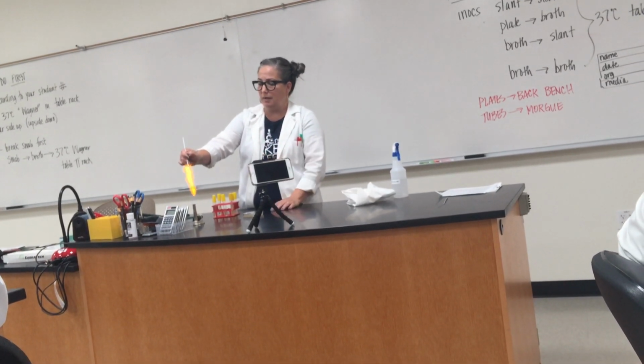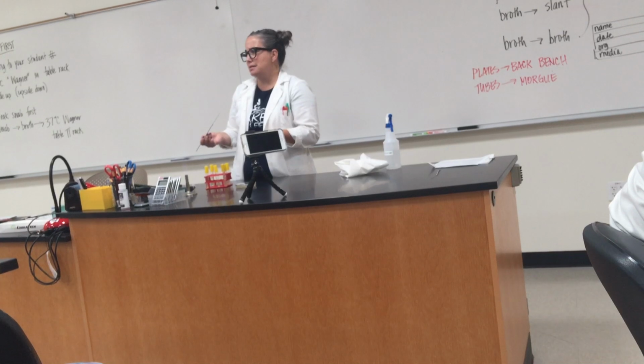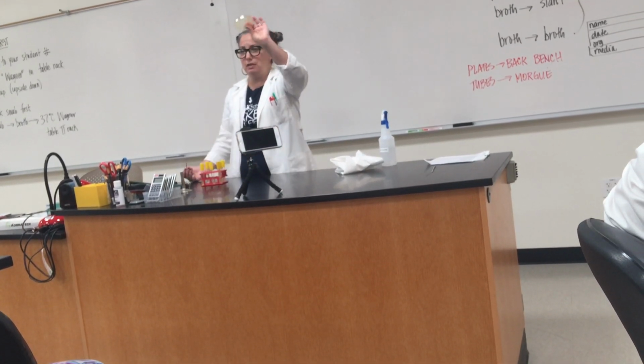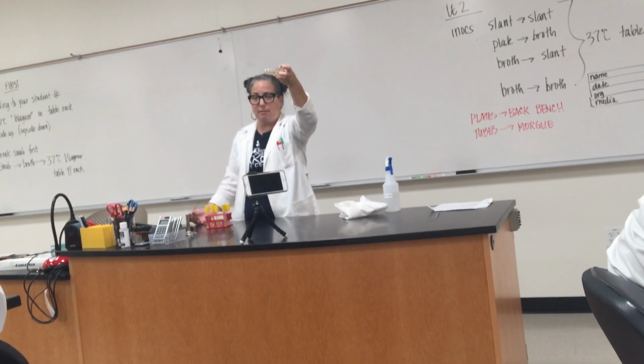So it will cool pretty quick, and they're actually a lot more tolerant of heat than we are. So even if you touch it and you're like, woo, that's still really hot, it doesn't necessarily mean it's too hot for them. Now, last thing that you're going to be coming from is the dish, right? We always work with Petri dishes upside down for the same reason that I just said, so stuff that's on the lid doesn't contaminate them.